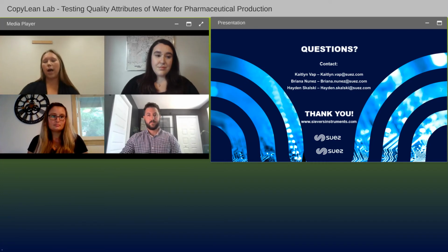Those include a method transfer phase between the lab-based instrument and the online-based instrument, and then a method comparability study where you're evaluating the efficacy of the online instrument against the laboratory-based instrument, and then also a point of use comparability study where you're evaluating the quality of water at some of your most critical points of use against the quality of water at that instrument that's permanently installed and being used for release. So the final answer there is that those additional validation steps are really what differentiate your ability to monitor versus release water with an online instrument.